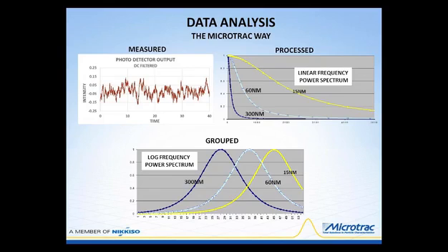The picture of light scattered from moving particles can be thought of in terms of a frequency shift imparted to the scattered light due to the fact that it is being scattered from a moving object, and a Doppler shifted frequency is imparted.